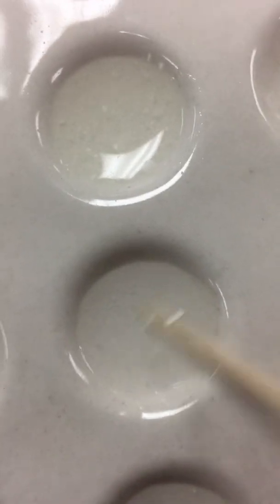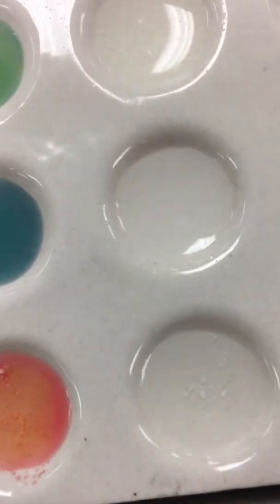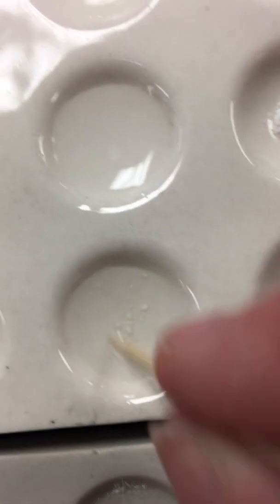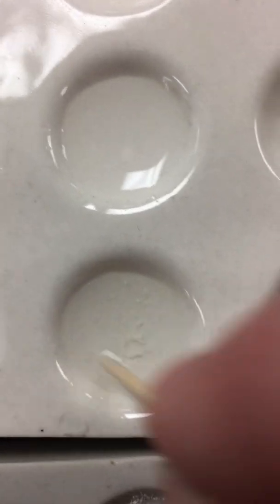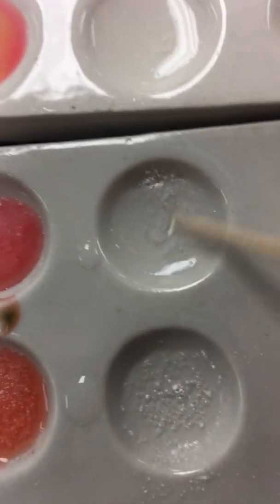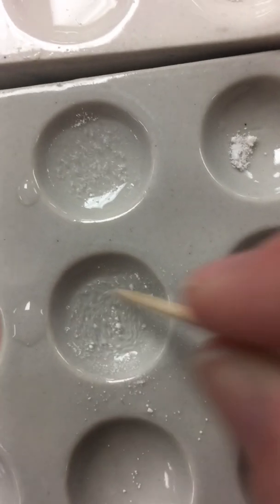Then this is the sodium bicarbonate, and it bubbled up pretty quick right away and dissolved. And then we have acetaminophen, and it still looks like it didn't dissolve real well, so there are still some particles. Let's get a new toothpick. We have Excedrin, which is sort of sitting on top, and same with the ibuprofen, just sitting on top.